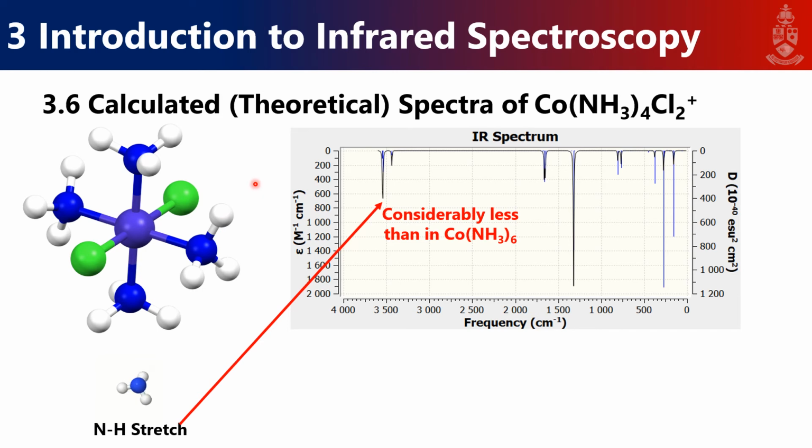One thing we do, however, not see is any cobalt chlorine stretches. I don't see them actually in this spectrum. You don't have to worry about that. You don't really have to identify them. You might be able to see them in your experimental spectrum. So that's something you can also look for, because that's unique to this structure, right? There should be cobalt chlorine stretches.